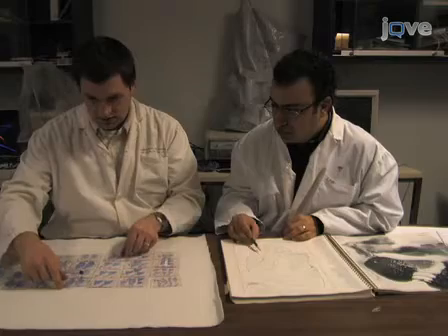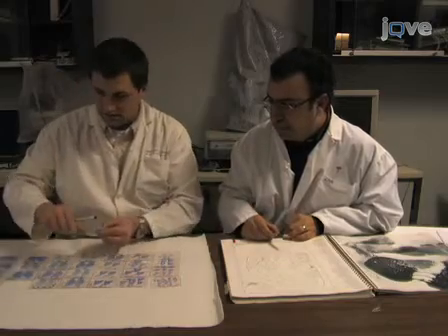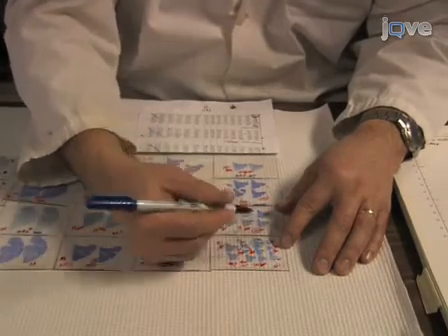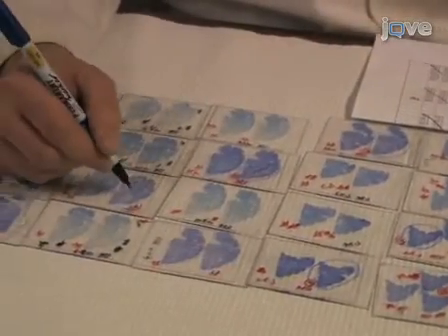For the frontal lobe of this subject, a total of 760 sections were systematically collected, with 76 stained for cresyl violet. Since the target was 10 sections throughout the reference space, 1 out of 6 cresyl violet stained sections were sampled. This leads to a section sampling fraction, or SSF, of about 1 out of 60.